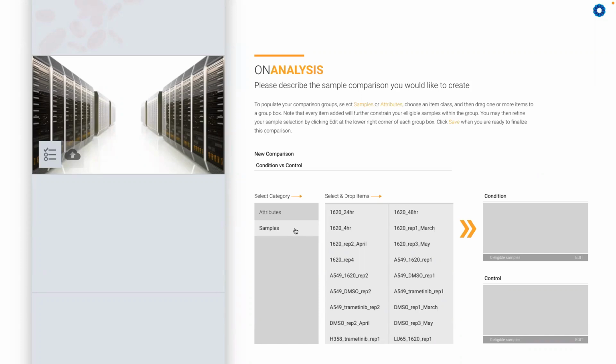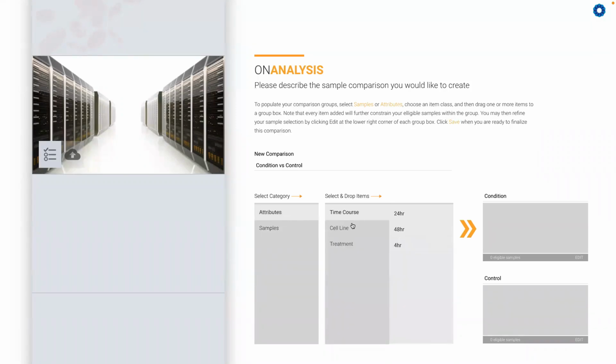And I understand that this is the way that many biologists and researchers have had to do things in other systems. We're really happy to say just add the metadata. It's going to be incredibly useful. We follow the NCBI biosample bioproject data model. It's going to pay off. So set up your experiment, put the right metadata in. You can use it when setting up experiments. And when it comes time for publishing, everything is already in the right data model ready to go for import.